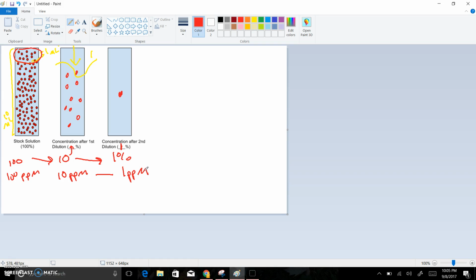Now I want to talk about the spectrophotometer and how it has the transmittance thing and the absorbance thing. What you do is you stick these test tubes, or really the cuvettes, which are just a small sample of it, into the colorimeter, so into that box. And into that box we are shooting colored light. There's different colored light. We could shoot red light at it, green light, orange light, and we also shot blue light at it. And these are at set wavelengths. That's why you saw the blue light was at, oh man, I can't remember the number, 450 nanometers. The red light was at 500 nanometers, something like that. So there are different wavelengths. It just tells you the different colored light.